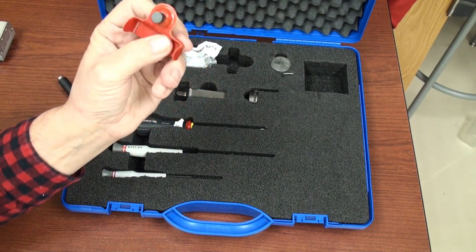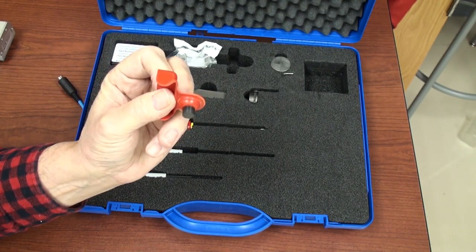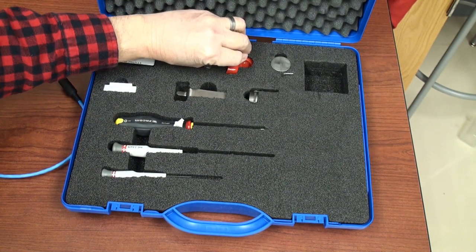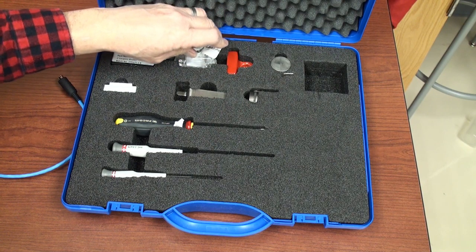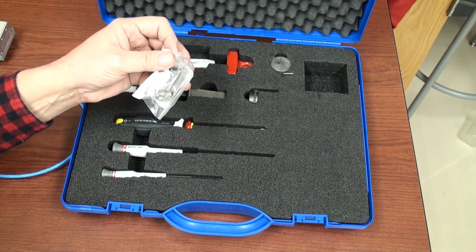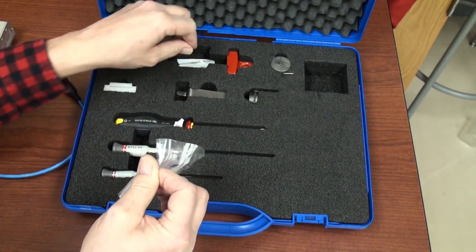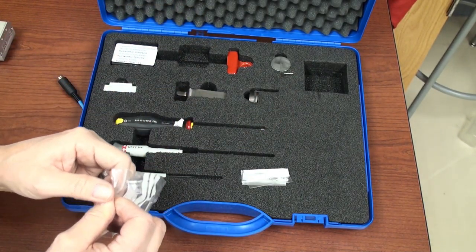This is a safety guard which you can put over the entire knife assembly when a knife is installed. This is a safety feature to prevent you from cutting yourself — and anybody who's done tissue slices or worked with razor blades in the laboratory knows that accidents do happen. This helps mitigate that situation.